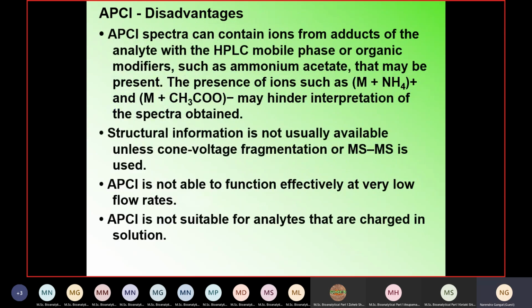Any questions on what we have studied today? We have studied two techniques: one is thermospray and one is APCI. Now the major difference between CI, EI and these techniques is that CI and EI are standalone ionization sources. You need an inlet system or an interface separately. In GCMS, typically I told you a transfer line is used as an interface, and you have a separate ion source, which is EI or CI. Whereas here the interface is also used as an ionization source.